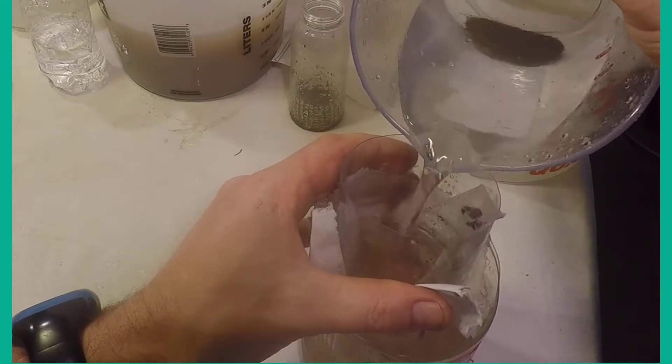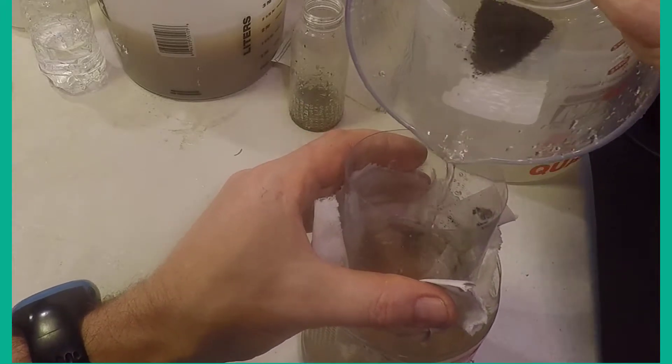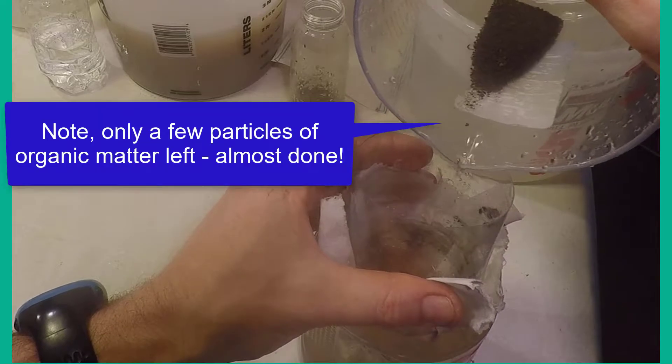Shaking the decanting container slightly as you pour and watching the different fractions separate will help this process.